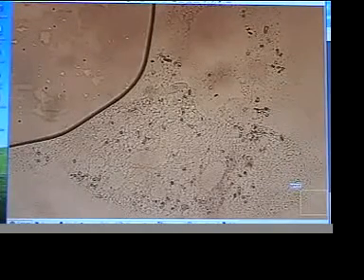I'm going to quickly change the lighting here and see what is revealed. We'll lose the picture for 1 second. There you can see the organism is touching an air bubble here, or was touching an air bubble. And you can see the remnants of it. It's really interesting to watch this because you can see, maybe if I put a touch of filter on there. No, it doesn't really help. You see that there are some spheres forming over here. That was a paramecium.